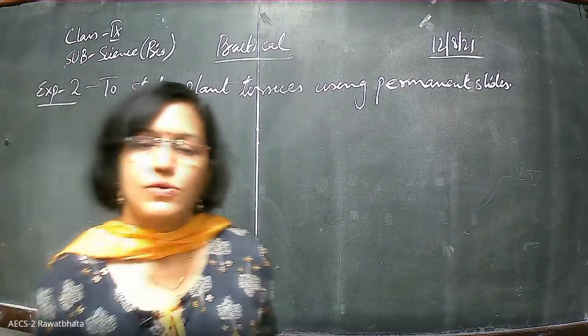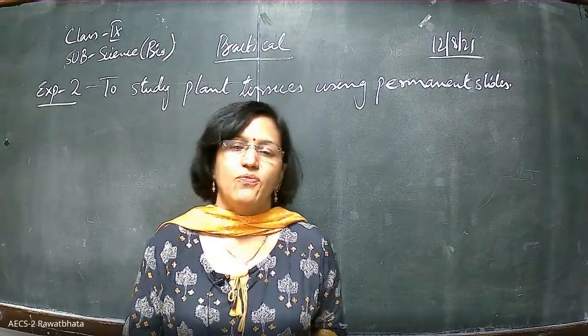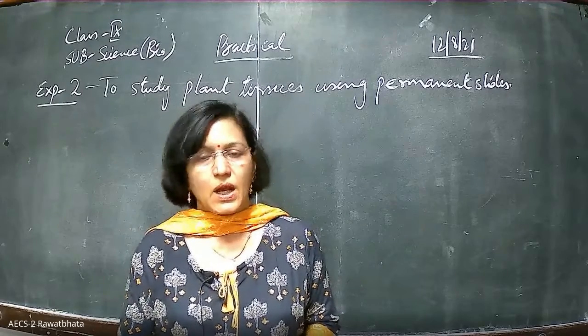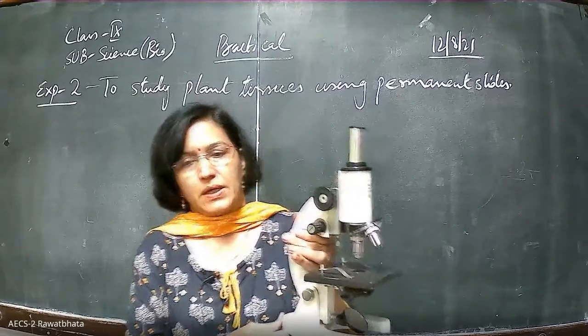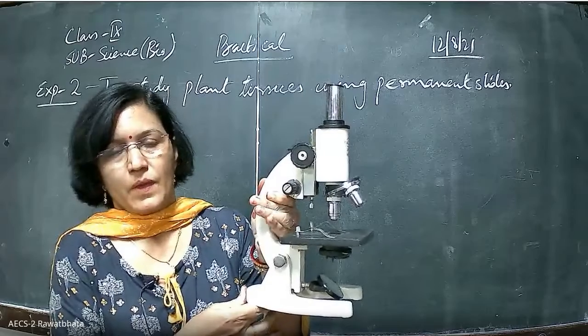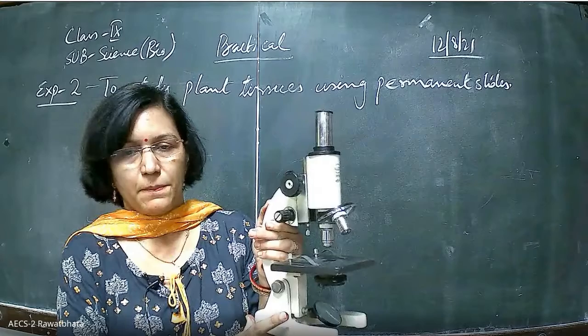Good morning kids. So today we are supposed to deal with the study of permanent slides. Permanent slides and how to study them. Like in the previous experiment, I had shown you the microscope. The structure of the microscope we are very well aware of already.